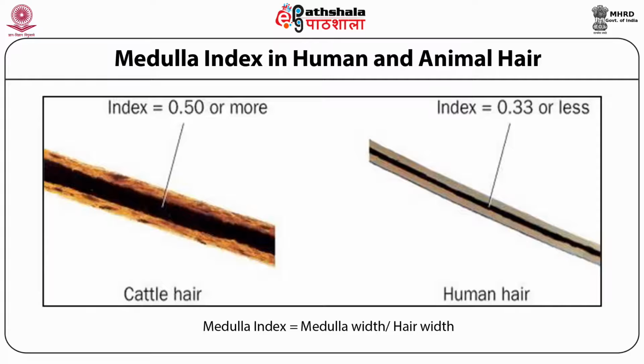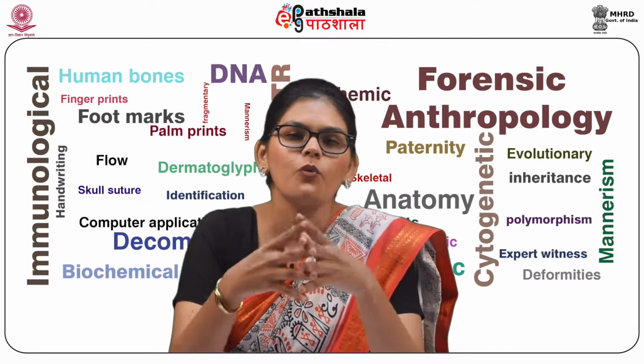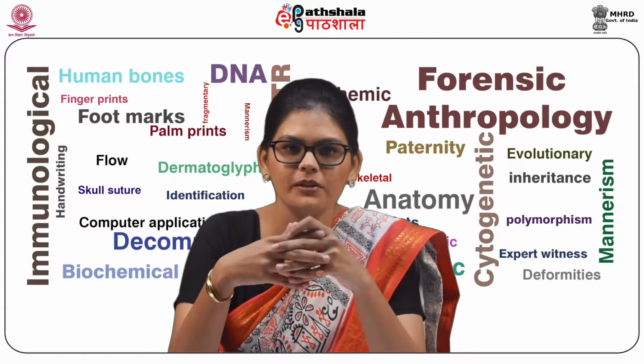In humans, the medulla structure is often fragmentary or trace, discontinuous, broken, or it may be continuous. So students, let us see what we have learned from this module.